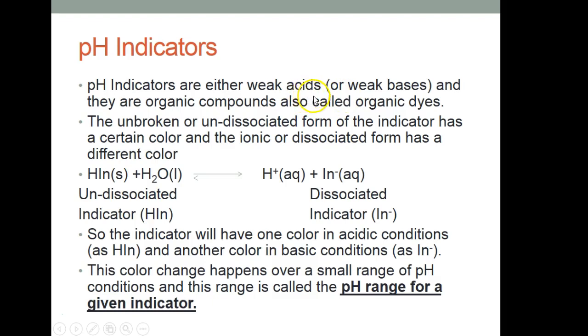When you do these acid base titrations and you neutralize the acid and the base, the end point when they are neutralized could either be neutral, like around pH 7, or it could be in the acidic region below 7, or in the basic region above 7. So, in order to be sure that you have reached the end point, you need what is called an indicator.